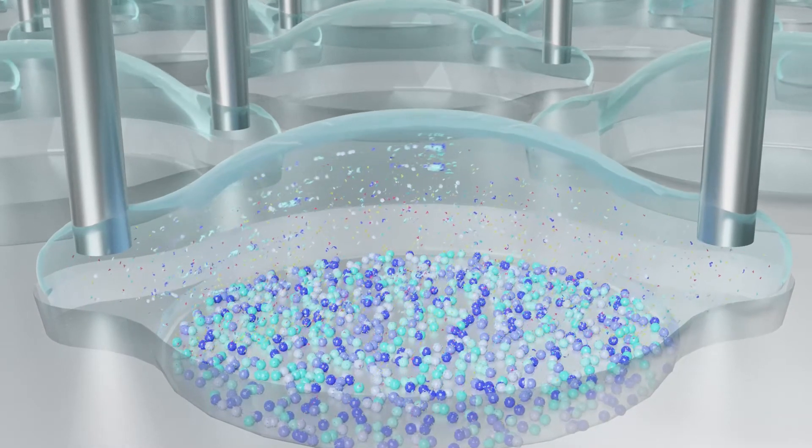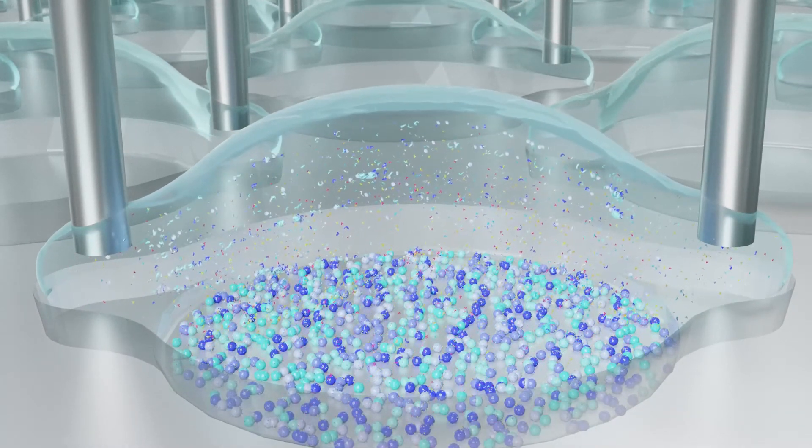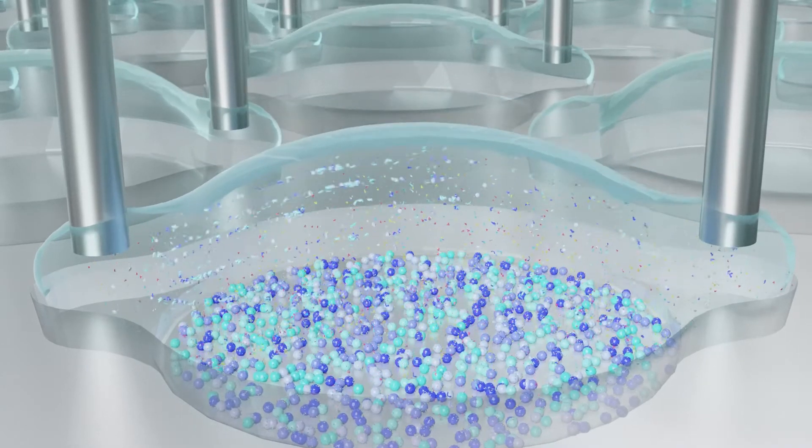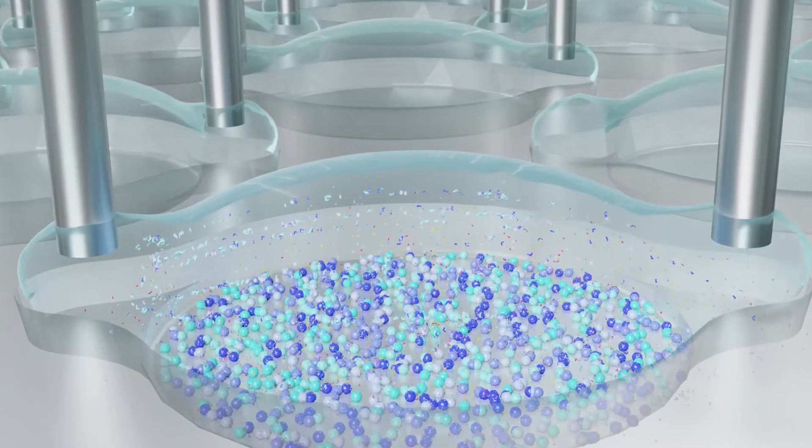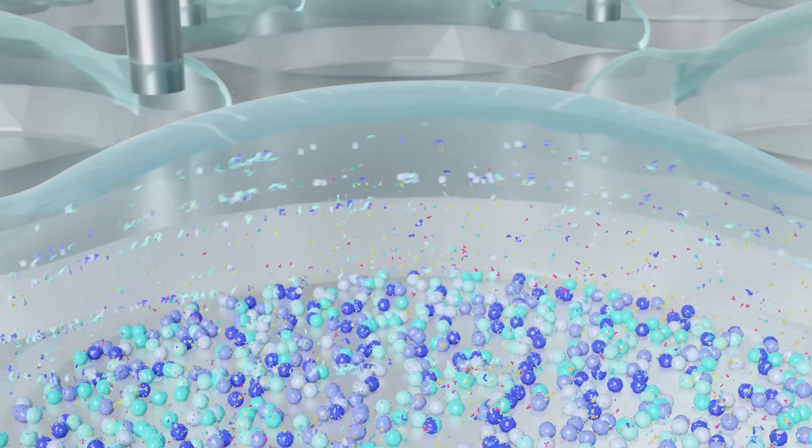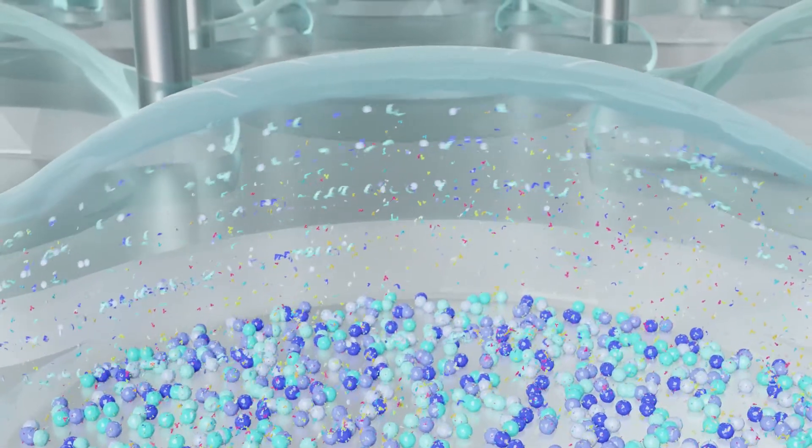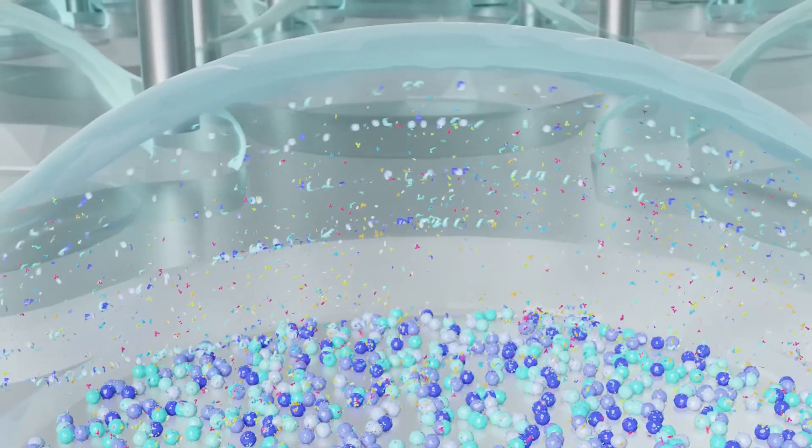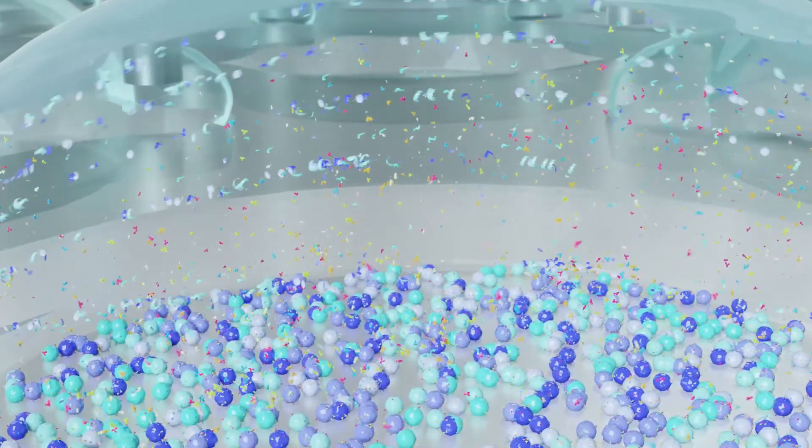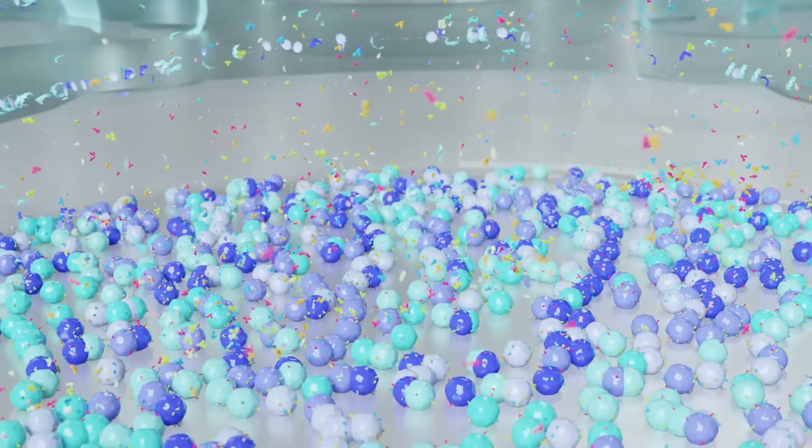The nozzles initiate laminar flow by precisely dispensing and aspirating buffer at the opposing satellite areas of each well. The low wall, in combination with low flow rate, creates laminar flow with the greatest velocity at the top, while rates are near static at the bottom where the cells of interest are located.